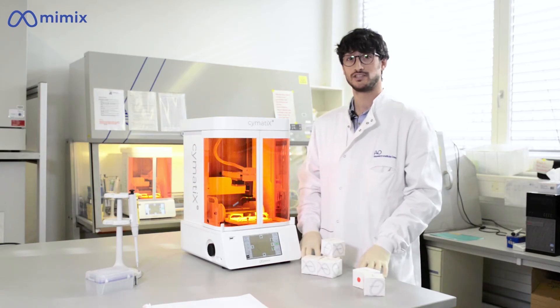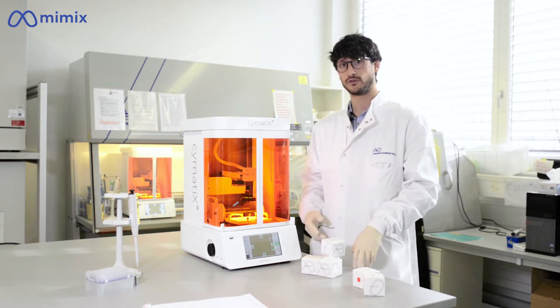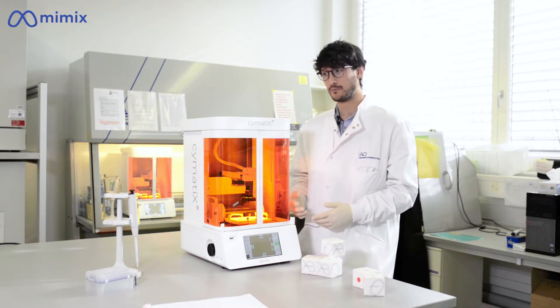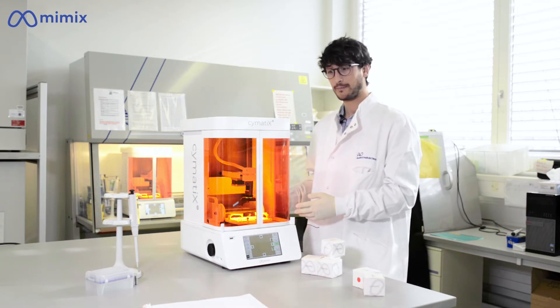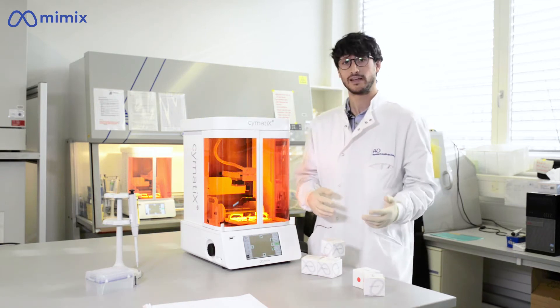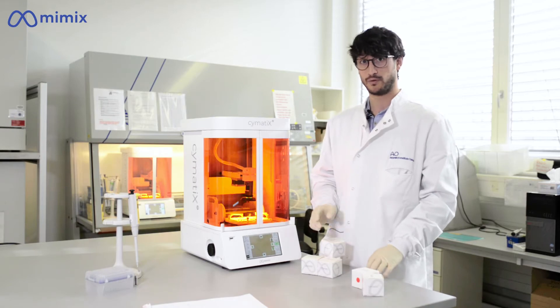Hi, I am Nicola Di Marzio, PhD student at the AO Research Institute Davos, and I'm glad to introduce you to CymatiX, an acoustic biofabrication platform which is a tabletop device and can fit on a lab bench or into a biosafety cabinet. It's a comprehensive solution which comes directly with a biomaterial and labware portfolio.